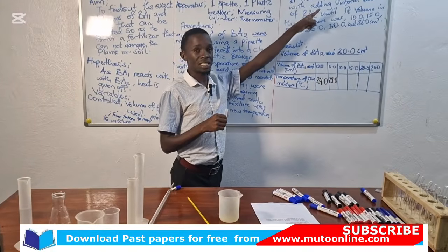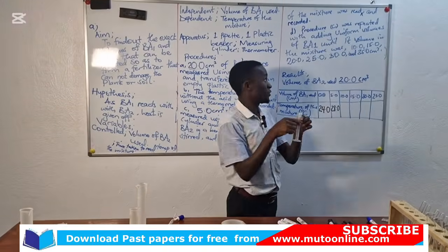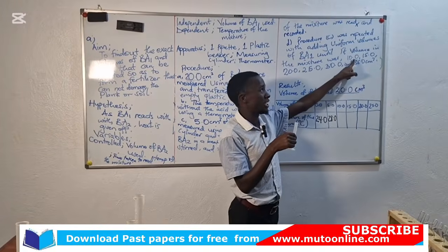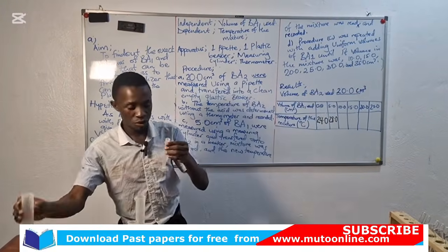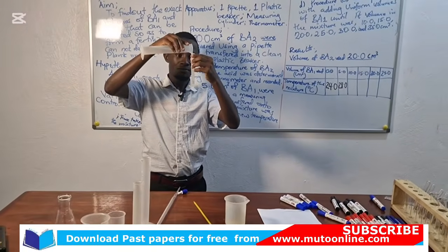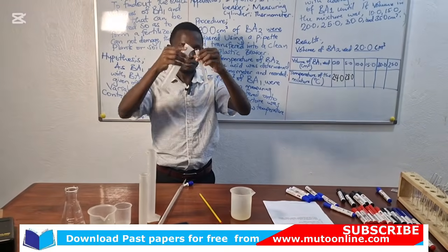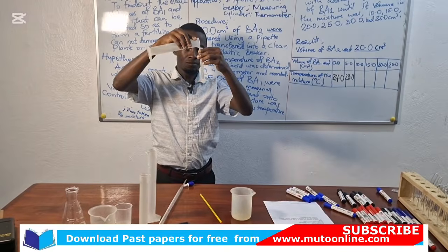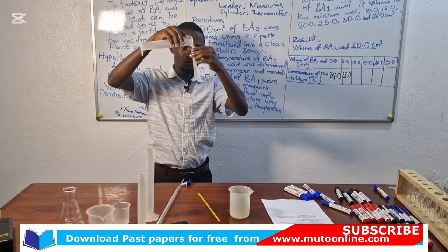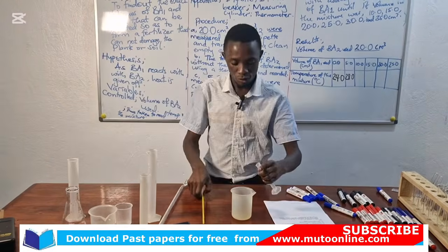When I add, I am going to repeat the same procedure. Again, adding a uniform volume, the volume I added at first, that was 5. So I'm adding more 5 to make it 10. So I'm going to measure 5 again. So I'm putting 5.